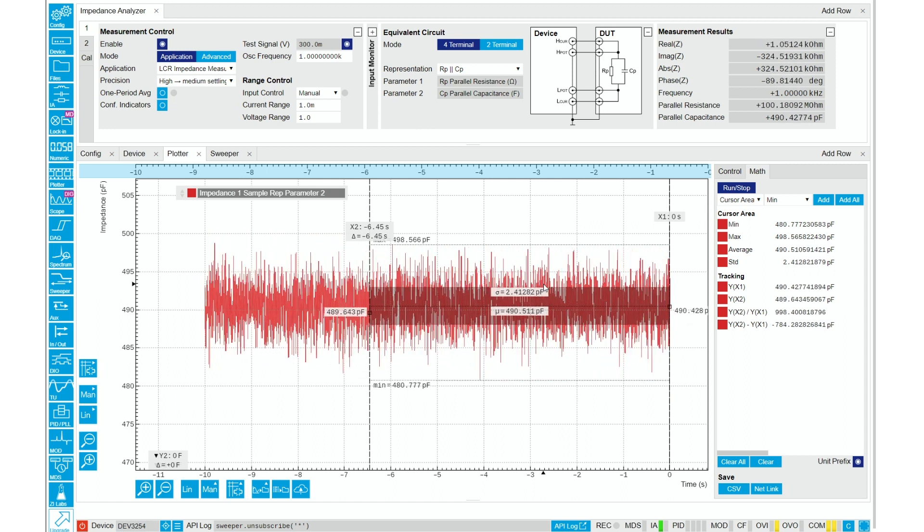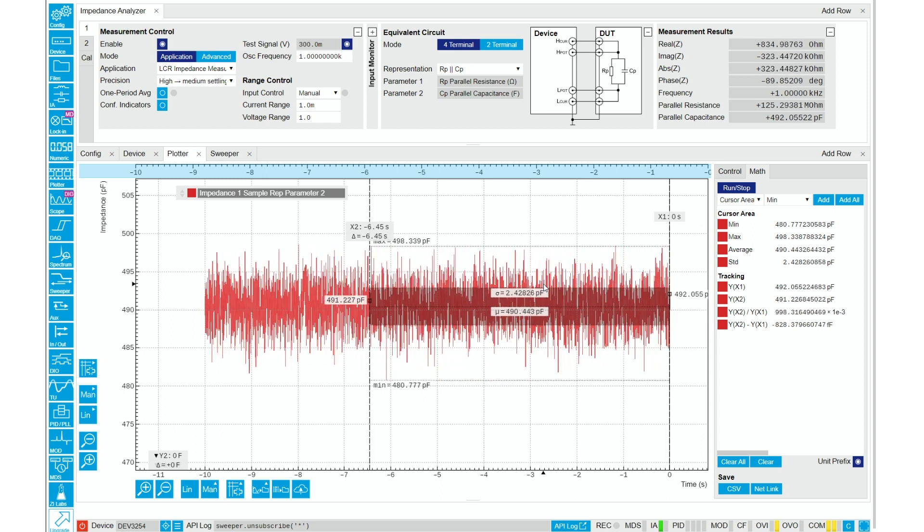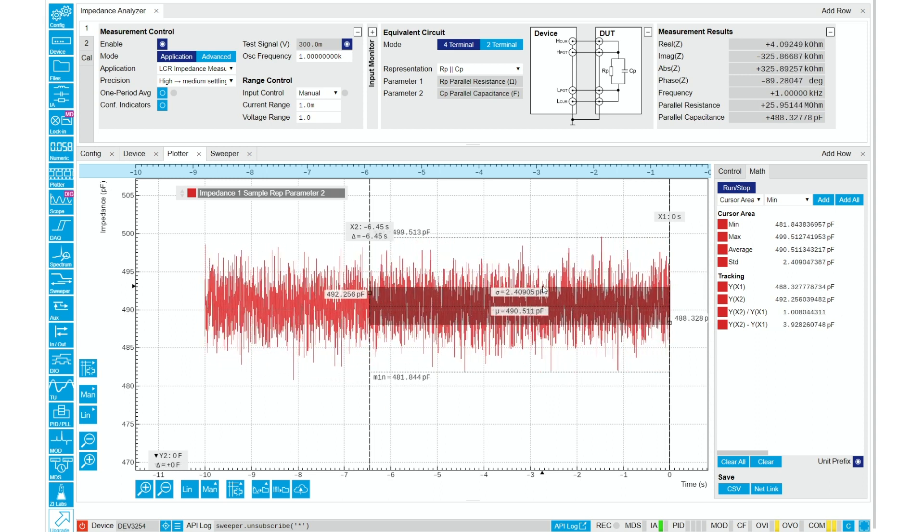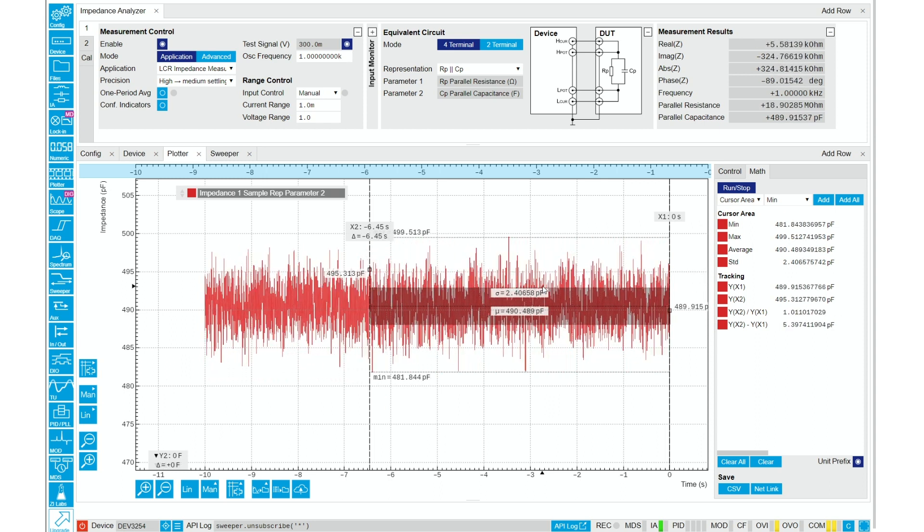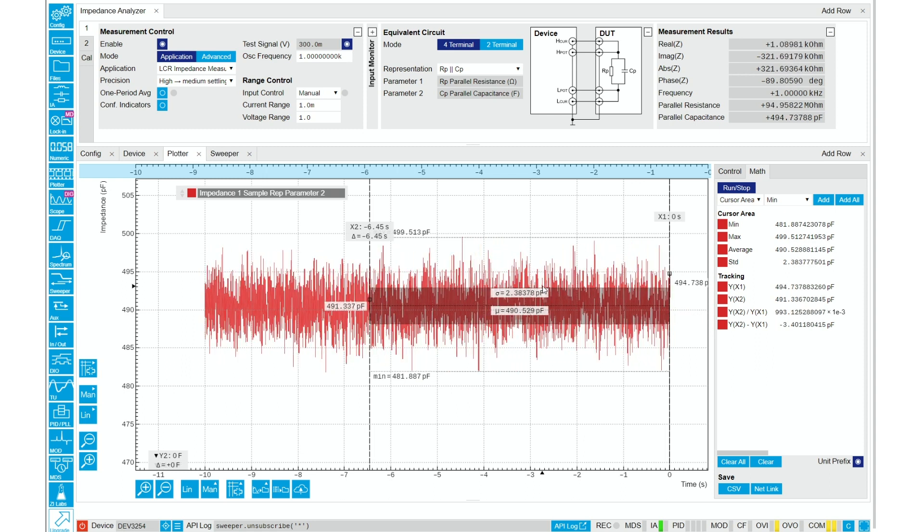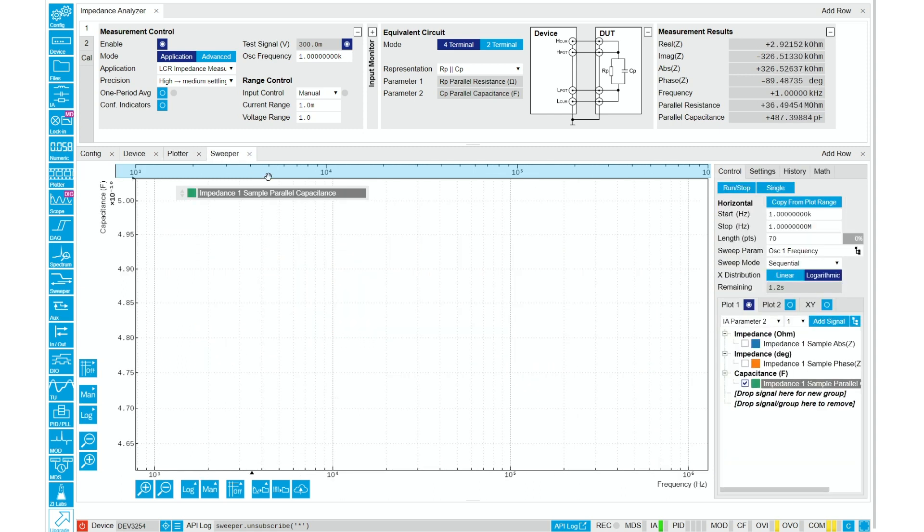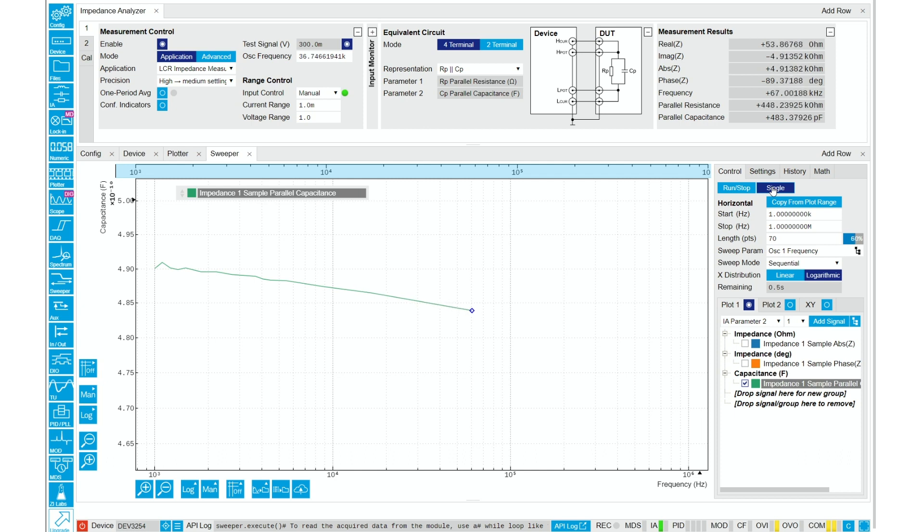You may notice that we don't know the exact dimensions, so we perform our measurement in air as our reference at first. After running our first sweep inside our liquid of interest, we can then normalize to the air result to get the relative dielectric constant.